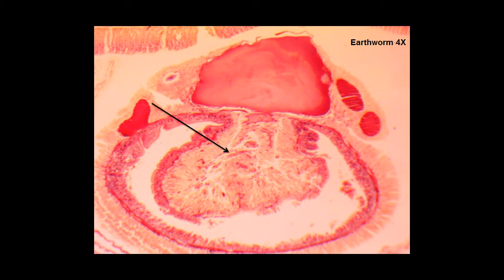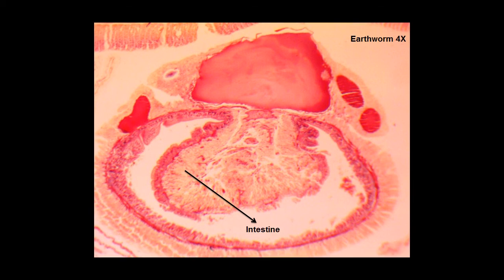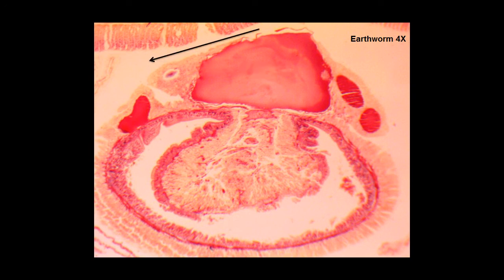What is the name of this structure? The typhlosole. What am I pointing at here? This is the cavity or lumen of the intestine. What is the name of this structure? This is the dorsal blood vessel. What is the name of this cavity that surrounds the digestive tract? The cavity is called the coelom.